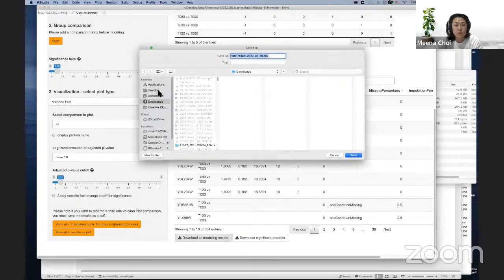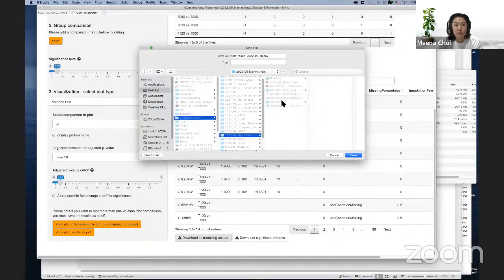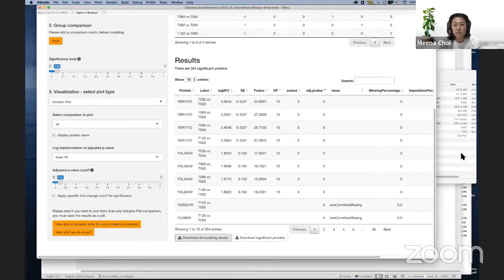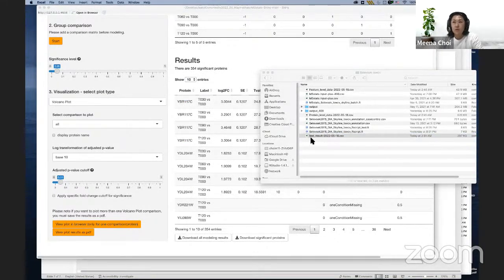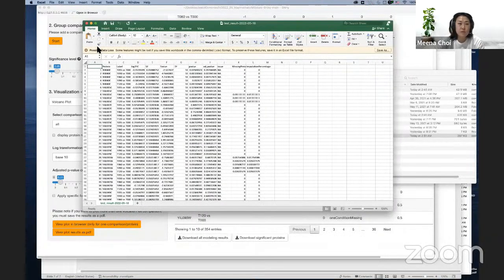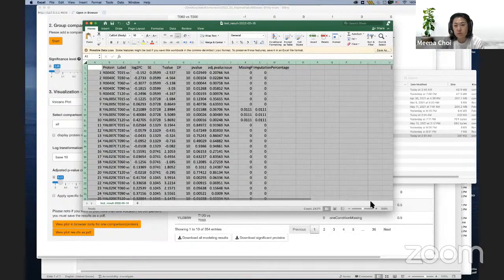Okay, so not the download here. Save the test result, yes, here, test result we have. So this is the result.